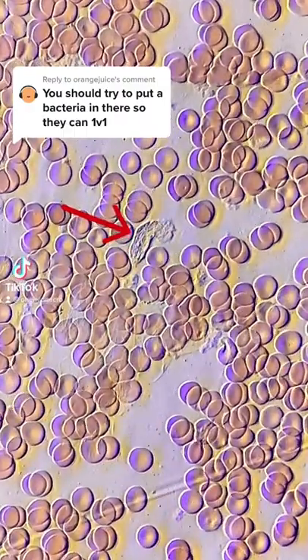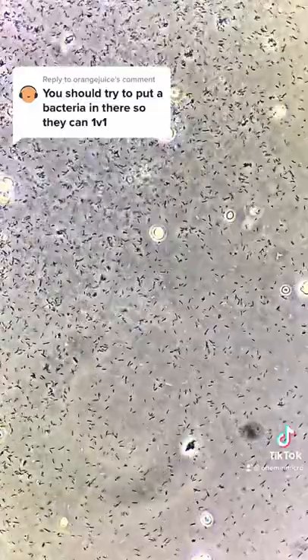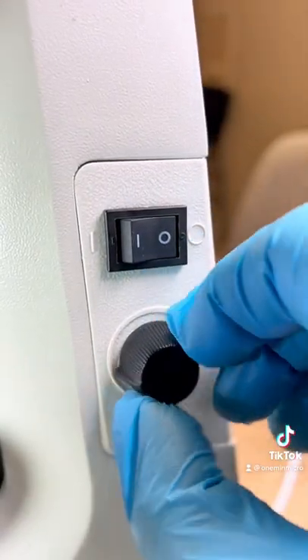This is the matchup you've all been waiting for: white blood cells versus bacteria. Today under the microscope, I'm going to mix a sample of my blood with a whole bunch of bacteria in this syringe. I mixed both bacteria and my blood sample. Let's have a look at what happens under the microscope.